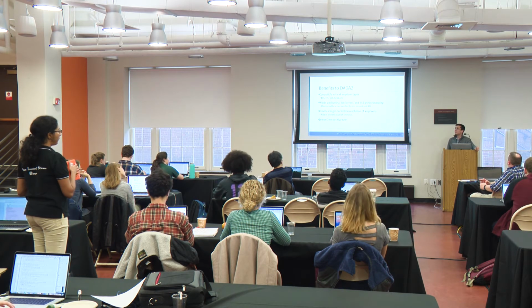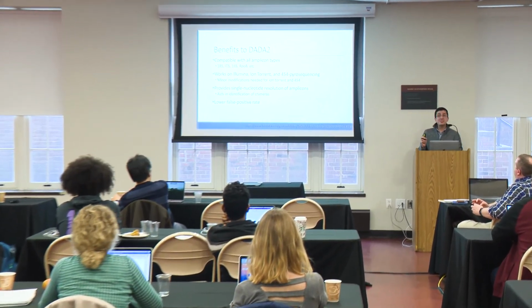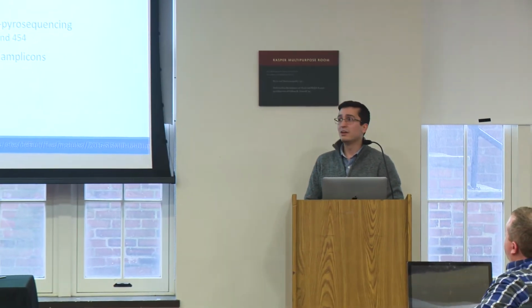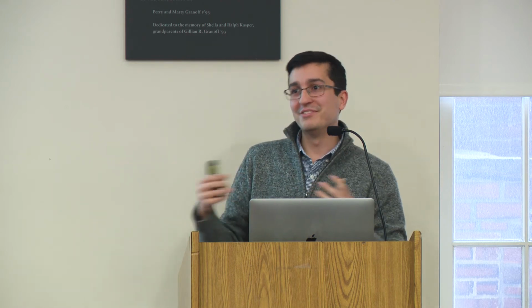Yeah, so DADA2, I'll go into this a little bit more. Since it resolves, in some cases, single nucleotide differences, it's actually better if you want to get down to the strain level or species level. But depending on the hypervariable region, that just might not be possible. I'll talk specifically about V4. It's very difficult to get down past genus, no matter what program you use. So DADA2 is better if you want to get a specific, fine detail answer, but you're always going to be limited by your hypervariable region, regardless of what strategy you're using.